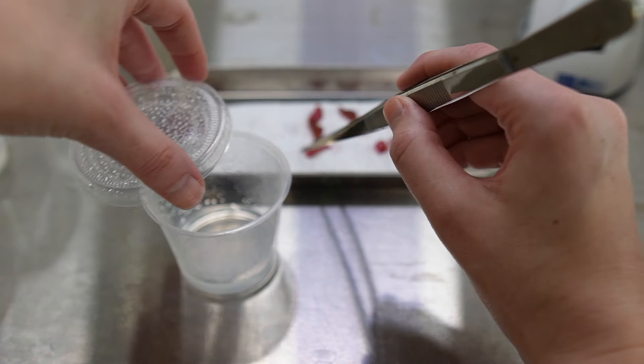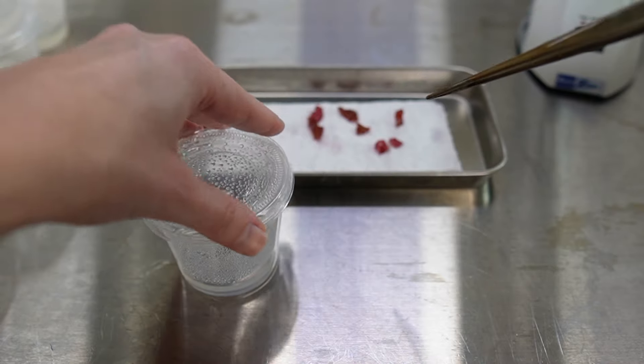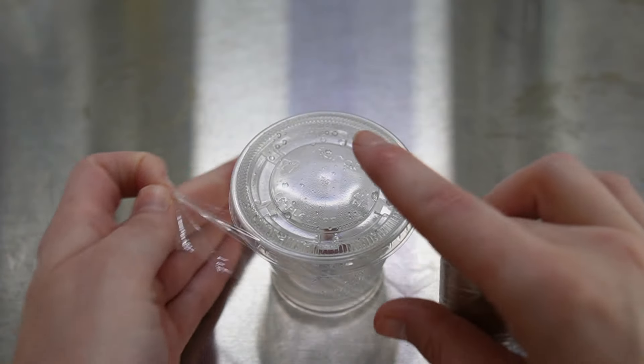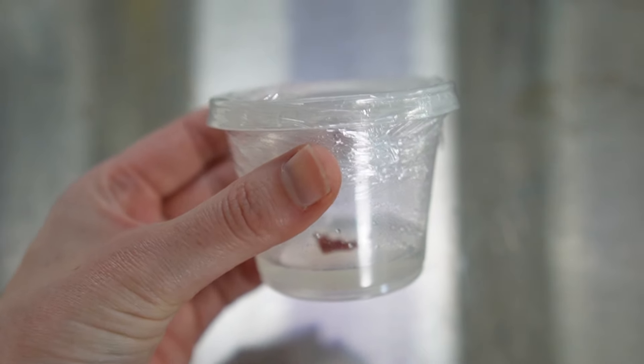To prevent contamination as much as possible, I stick to one explant per container of media. Once I have all the explants in their respective containers, I wrap each deli cup with saran wrap as an extra precaution. My contamination rate for begonias is around 10% with this method when using the laminar flow hood.